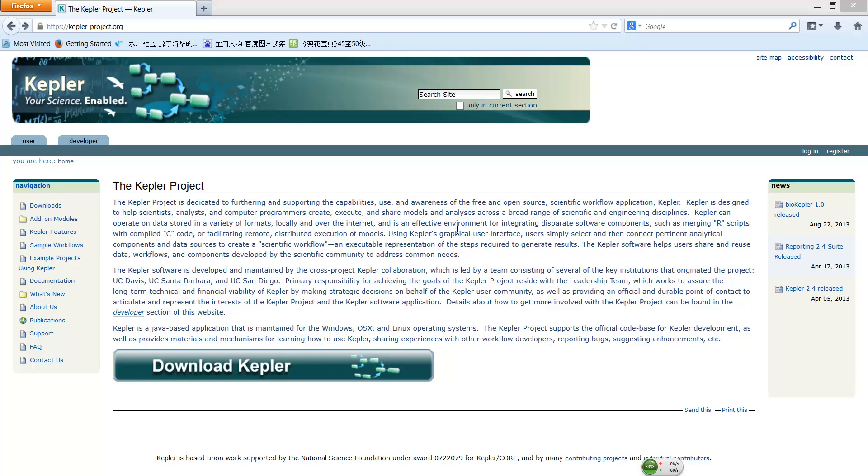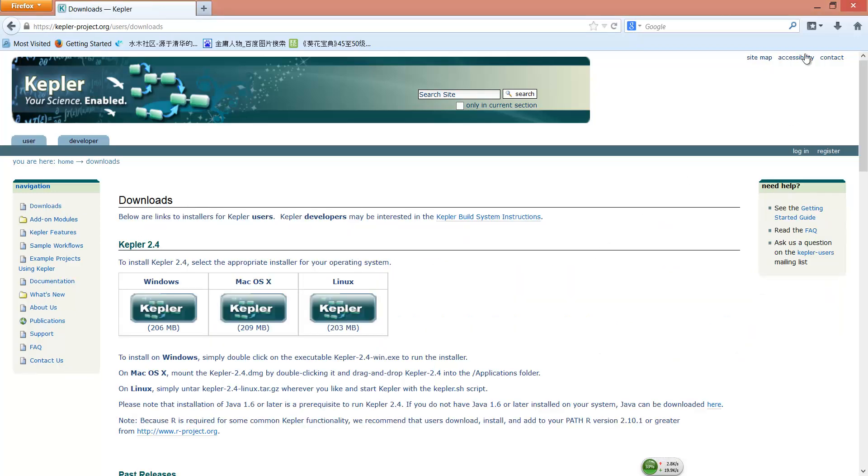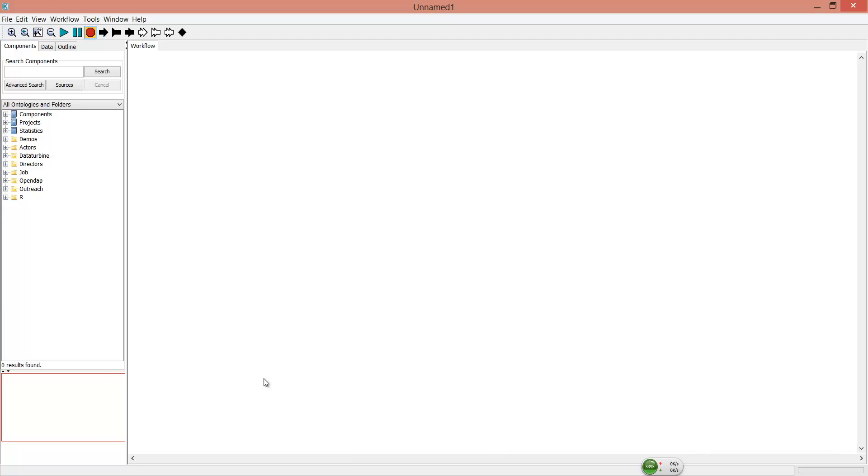Kepler is an open-source software which supports customized scientific workflow. You can download Kepler from their website. After installation, open Kepler.